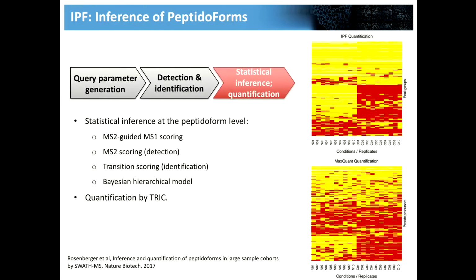So to give you as close as possible the real comparison. And the reason why we had so many columns, this is in the paper, is because one of the things that you see is that the more runs you add, the amount of missing values or degree of completeness have very different slopes. So you will start to add more and more missing values in alignment when quantification is done based on MS1 versus when it's done based on the MS2. And the resulting heat map or the resulting quantitative table will look very different, and of course the power, your statistical power, and what comes out of all downstream analysis.